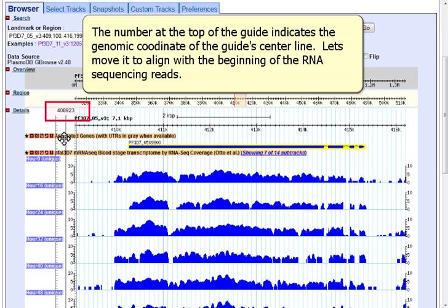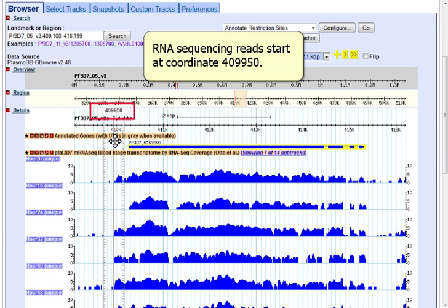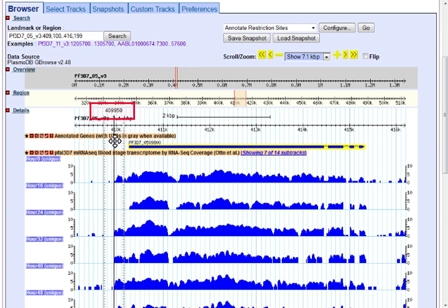The number at the top of the guide indicates the genomic coordinate of the guide's center line. Let's move it to align with the beginning of the RNA sequencing reads. We see that they start at coordinate 409,950.